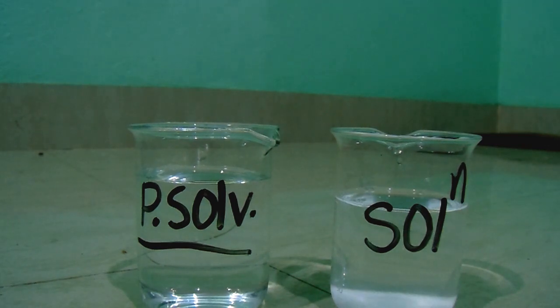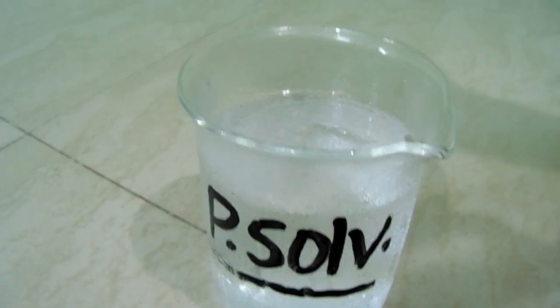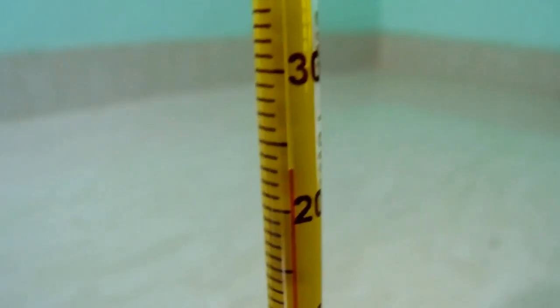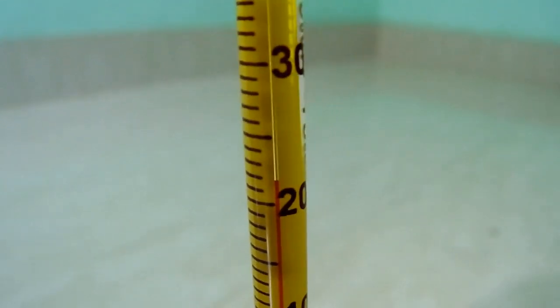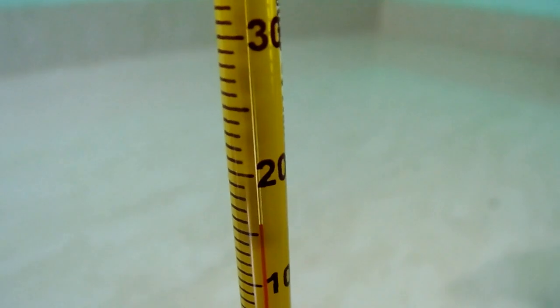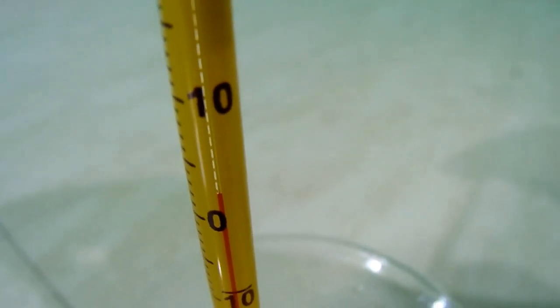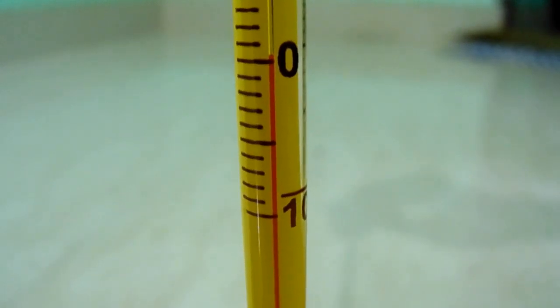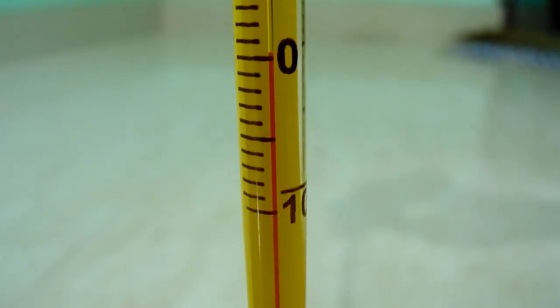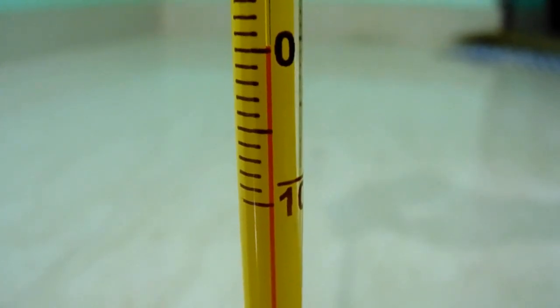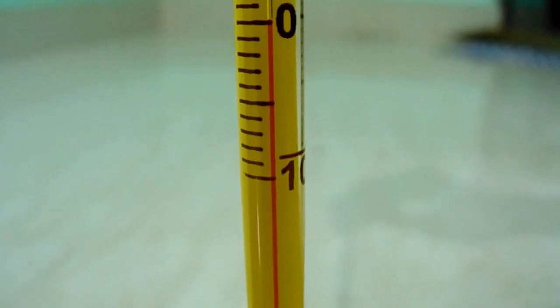Let us now start with the pure solvent. Here is the thermometer. The room temperature is 24°C. Now as we dip it into the pure solvent, see how the temperature is going down — 5°C, 4°C, 3°C — and now it is approaching and reaching exactly 0°C.